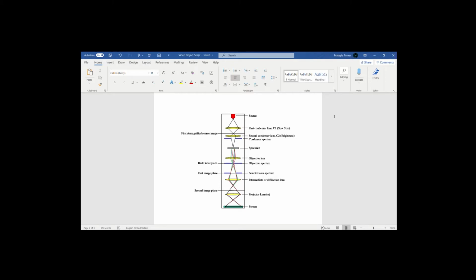The electrons fired at the material do not react nearly as much to the sample as neutrons do. TEM stands for transmission electron microscopy, meaning that electrons are transmitted through the sample and onto the screen. The electrons come from an electron source and are transmitted through a condenser beam system onto the specimen through a bunch more lenses until finally appearing onto the screen for scientists to see them.